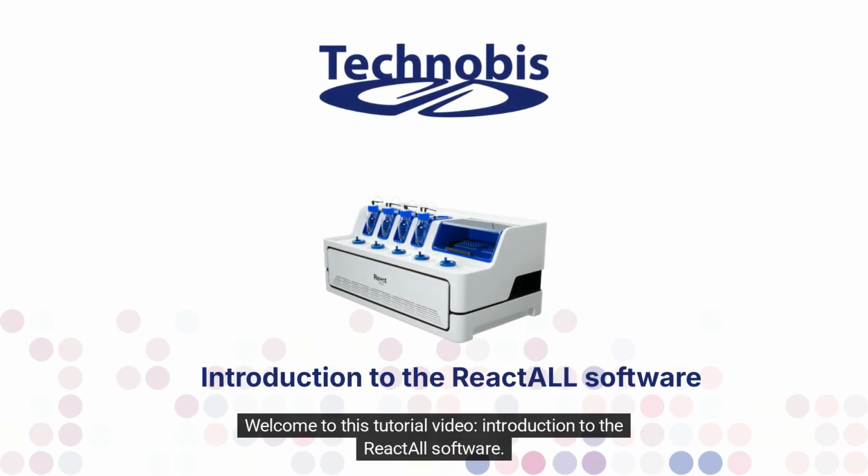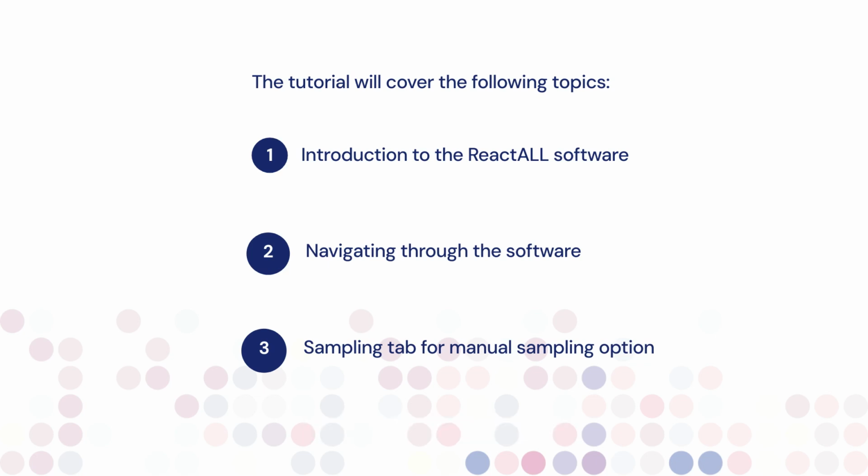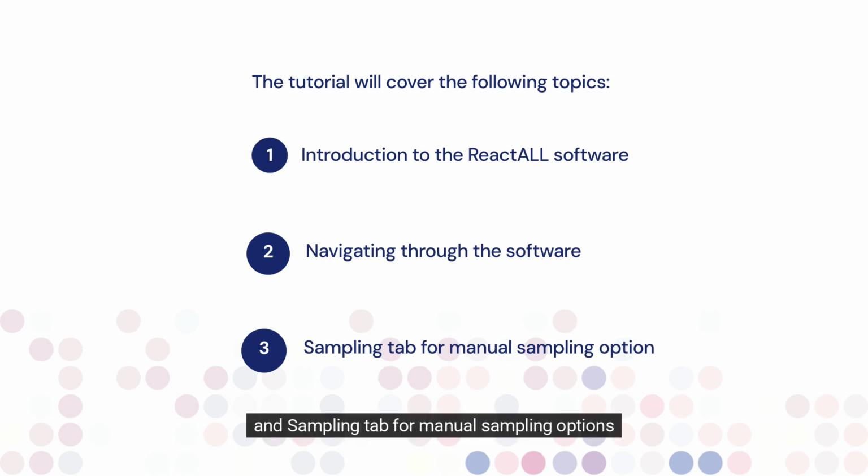Welcome to this tutorial video, Introduction to the ReactALL software. This video will cover the following topics: Introduction to the ReactALL software, navigating through the software, and Sampling tab for manual sampling options.